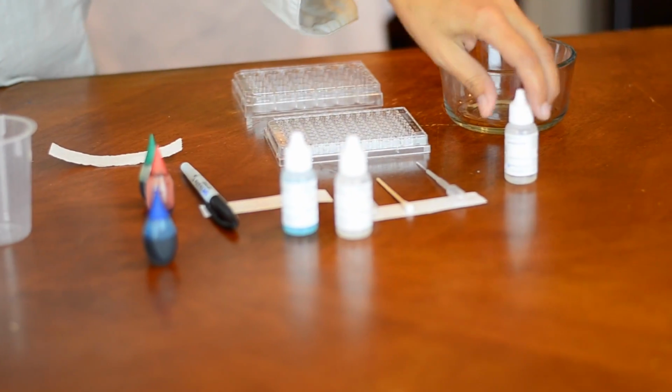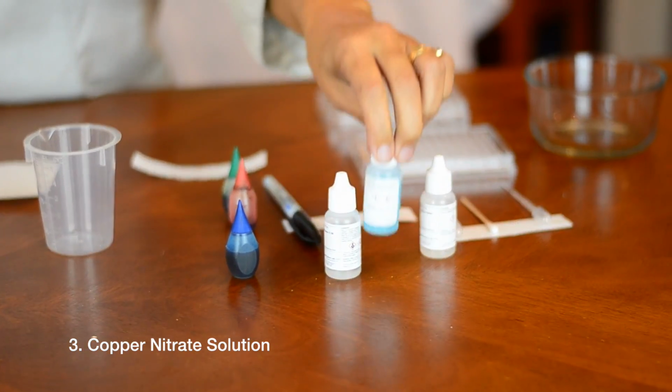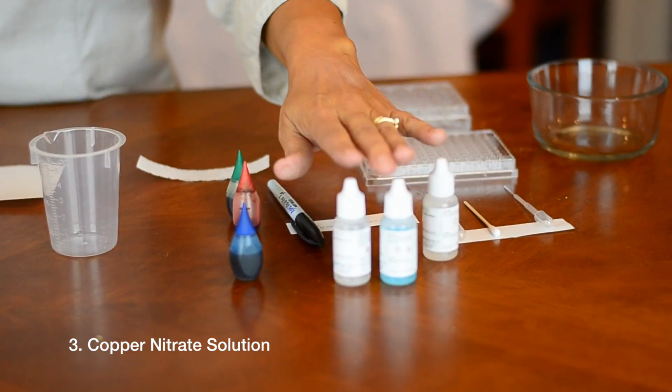As we go, I will point out a few tips that I want you to remember as you're doing this experiment on your own later. We'll start with the good stuff. We're going to be using 3 solutions from your microchemistry kit. There's a lead nitrate solution, and a nice pretty light blue copper nitrate solution. These are our 2 active reagents.